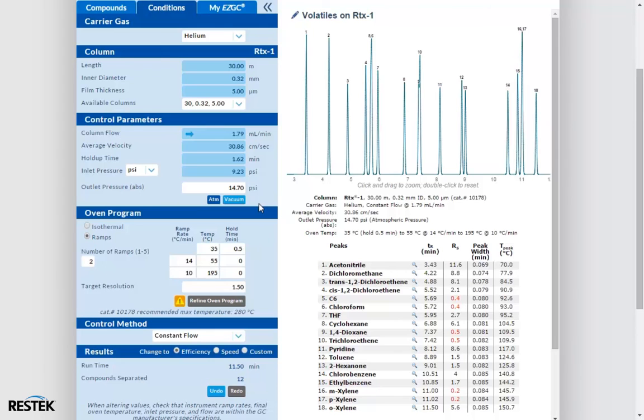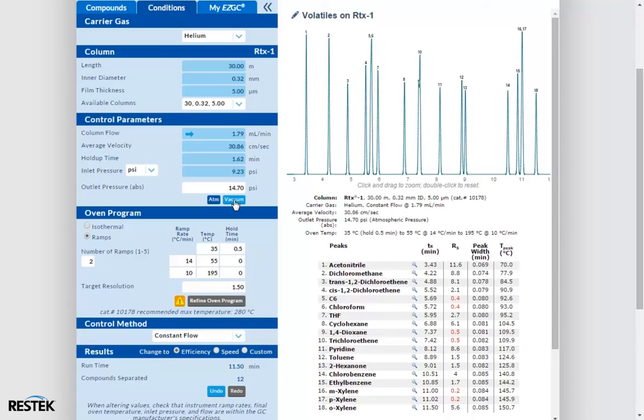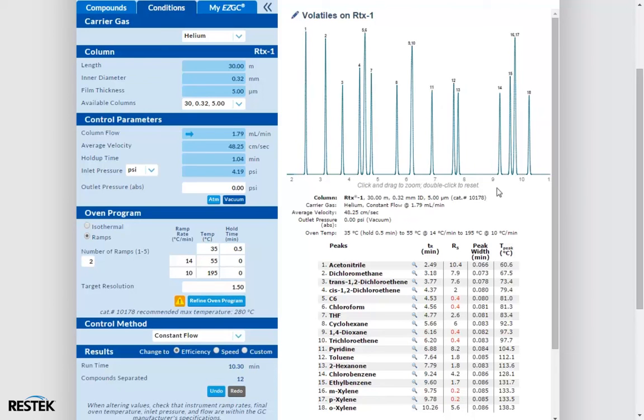Let's pretend that we're using mass spec so we can all feel better about these coelutions that we're seeing right here. If we're using MS, we need to make sure we have our outlet pressure set to vacuum. So look at the model. When we did this, we ended up changing the linear velocity, thus changing our elution temperatures yet again.